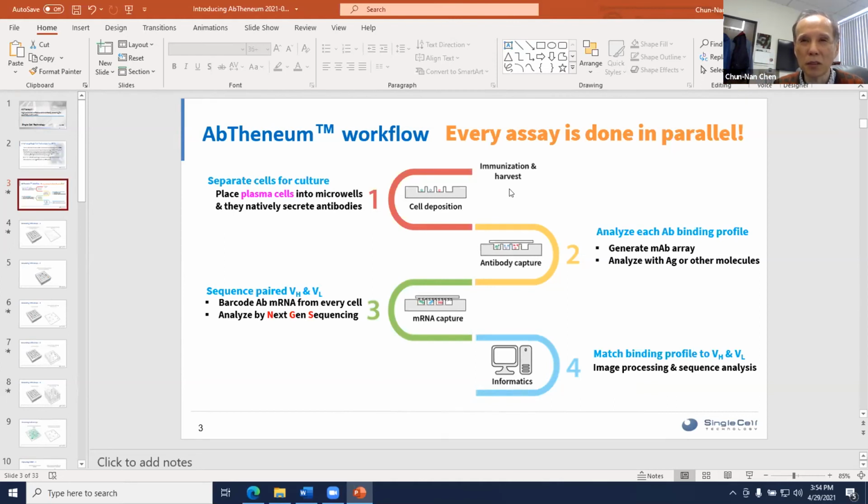So I think it will be a little clunky, so I wouldn't recommend it. I think you can make it work, but given that you've already gone through the process of mixing up the heavy chain light chain, you might want to stay with whatever works for the phage display. Yeah, sounds like phage display is just not necessary.